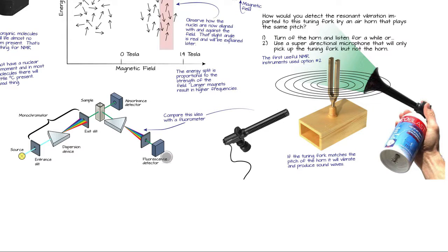Fluorescence spectrometry is really sensitive because I'm looking at if it emits light or not. I can count single photons with a good photomultiplier, so it's a really sensitive technique. And NMR can be really sensitive too if you design your machine very carefully. So consider this 90-degree arrangement.